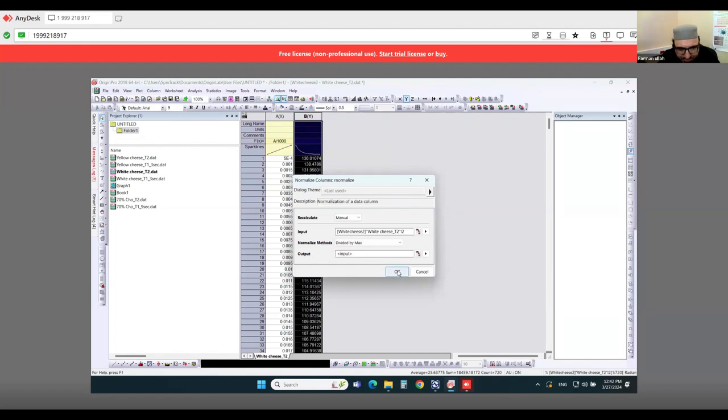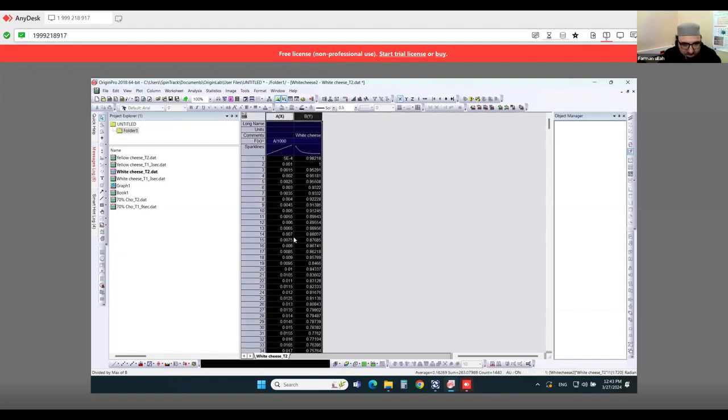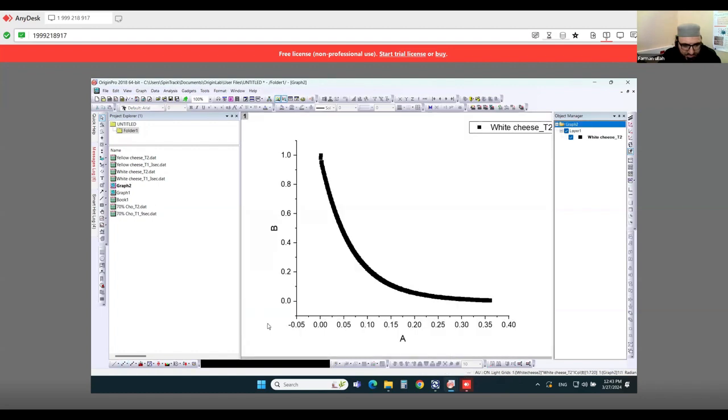Okay, and I will give the name here, sorry, T2. Let me plot this. Okay, let me arrange that.